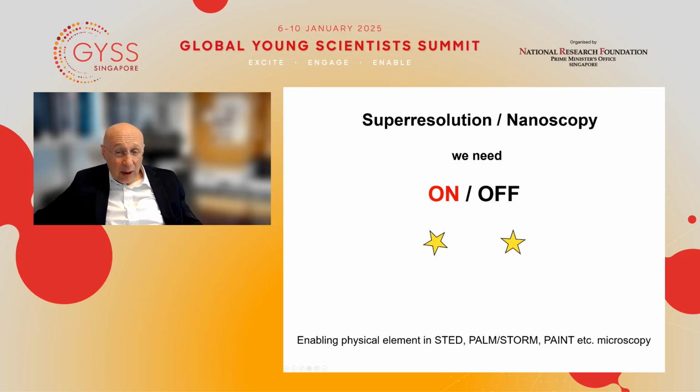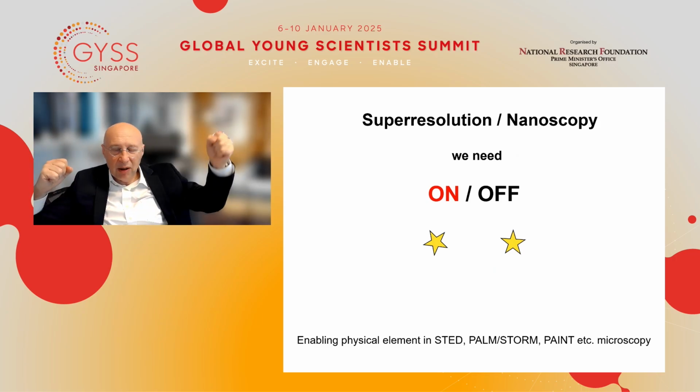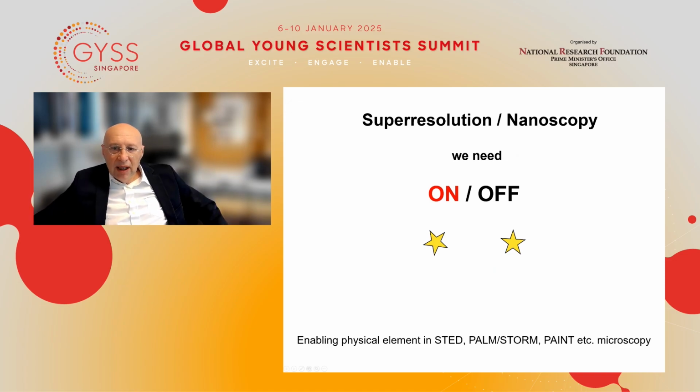But that's a fundamental problem in the concept, because if you need to see the fluorophores sequentially, you cannot see them at the same time, of course, inherently not. If you want to track both at the same time, it's not possible, because you have to turn this off and then it may go somewhere, whereas the other one you can track, of course, but this will go somewhere. Then you turn this one off and then this one may go somewhere. And that's a problem if you want to follow both at the same time.